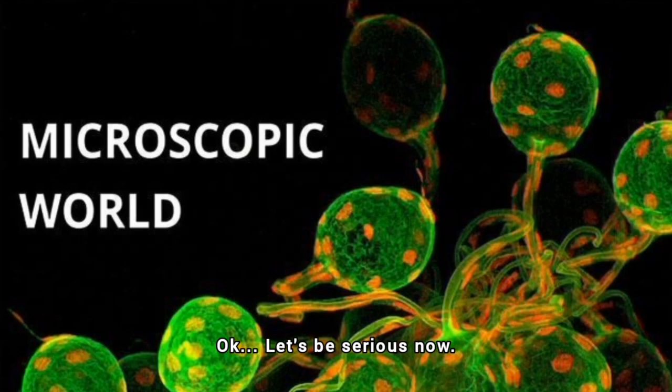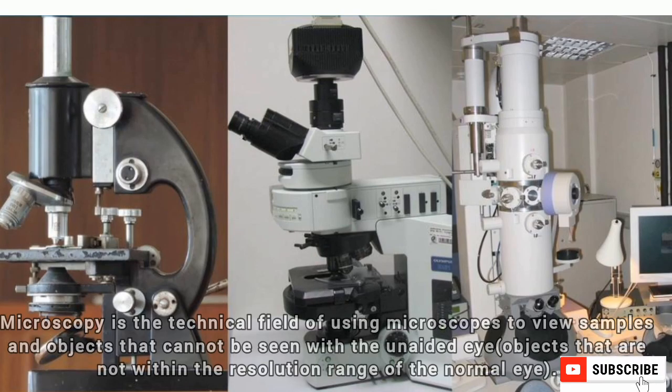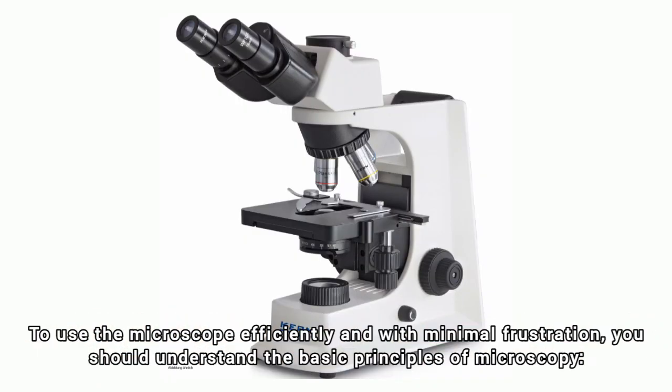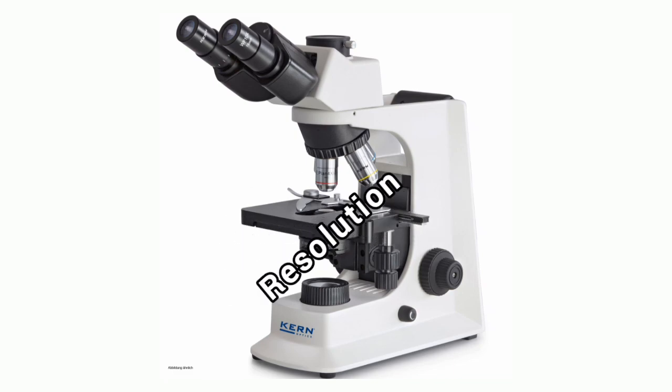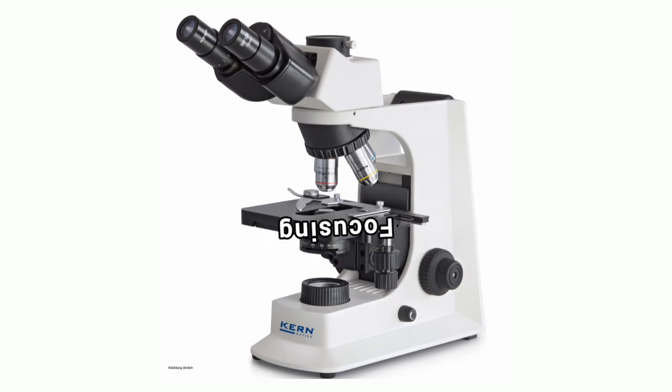Okay, let's be serious now. What is microscopy? Microscopy is the technical field of using microscopes to view samples and objects that cannot be seen with the unaided eye. To use the microscope efficiently and with minimal frustration, you should understand the basic principles of microscopy, which are magnification, resolution, numerical aperture, illumination, and focusing.